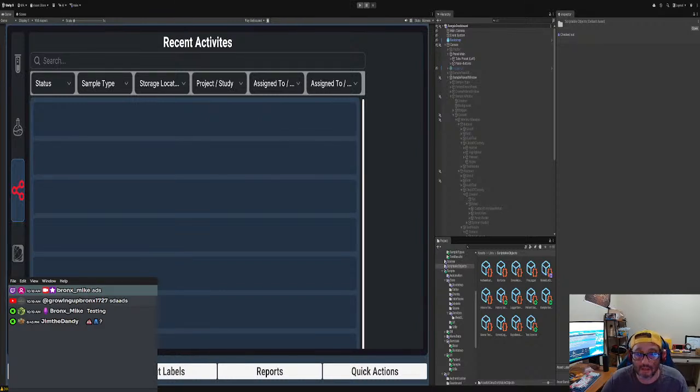All right. And so this just gives it, you know, being a method that allows us to initialize on boot up. And that's the screen that you see every time I press play. And then we have an unload, right? So we go back here, and then we get to the nitty gritty, right?